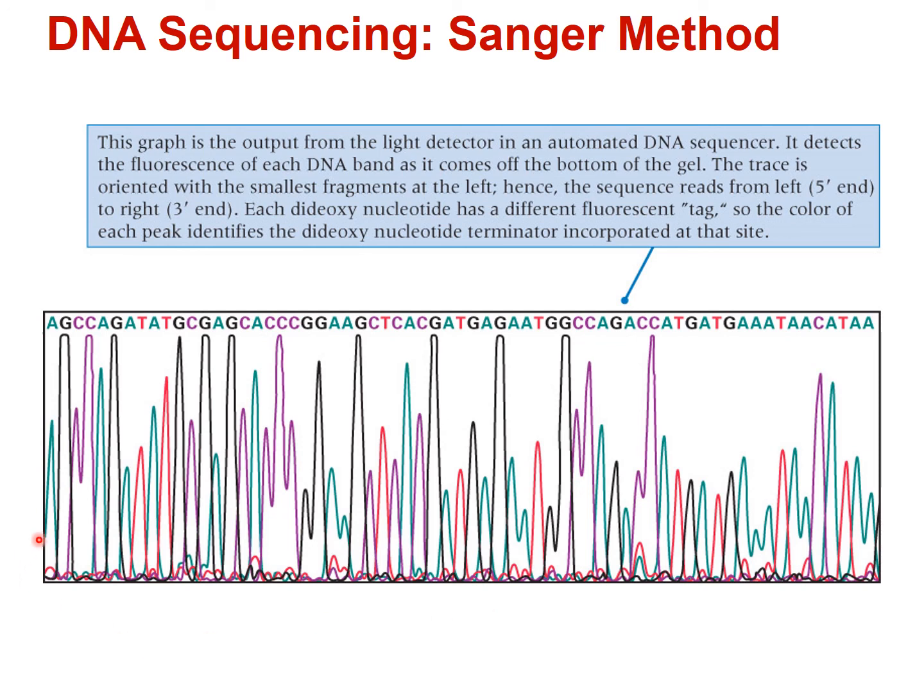This is the fluorescence that has been measured, and it's this chromatogram. You can see, if we pick this first position, that as the nucleotide approached the detector, we could see the fluorescence start to increase until it gets to its peak when it passes right in front of the detector, and then it starts to move away and goes back down.